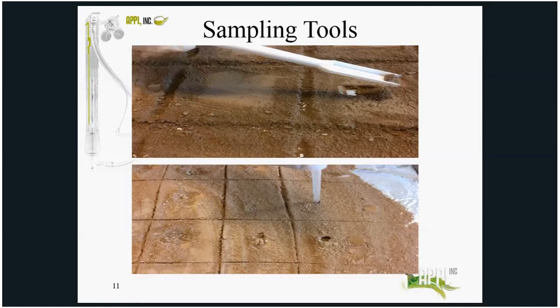Subsampling in this manner attempts to select a subsample that is representative of the bulk sample. That is, to capture the similar range of particle sizes, shapes, and associated contaminant concentrations in the lab subsample as occur in the bulk field MI sample.